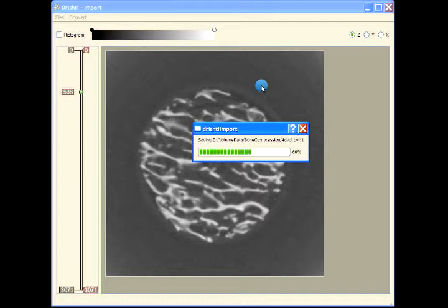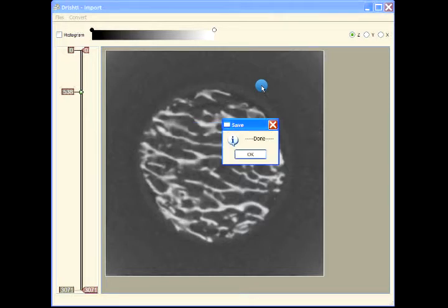Your data is going to be blocked up into 32 cubed pieces, blocks, and further I create an octree. So I go in and subsample the volume, and then save these different subsampling levels, which I call level of details. So you'll have the full resolution volume, then the half resolution volume, quarter resolution volume, and so on. I create about 5 different levels.